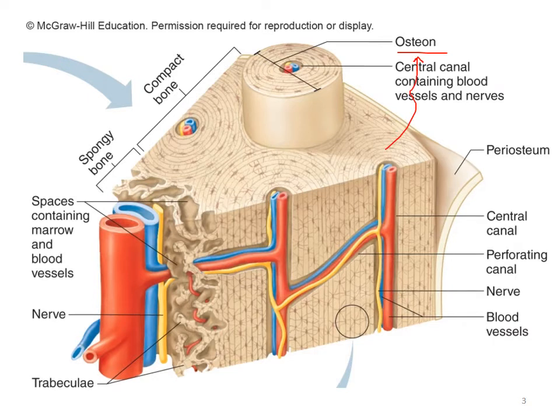Now, one of the things we'll need to look at is that even the osteons are made up of layers. You can see that these are multiple layers. That's why people say that bone kind of looks like tree rings, right? Trees that are cut crossways. These little rings are called lamella. Again, I'm hoping that you have your student handout sheets with you there. You'll see that they're called lamella.